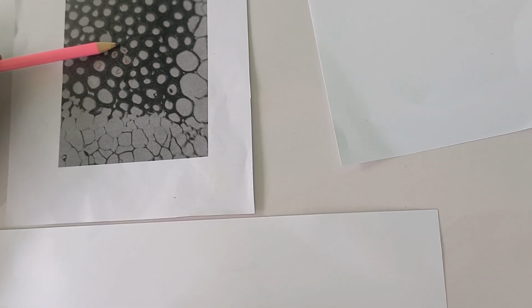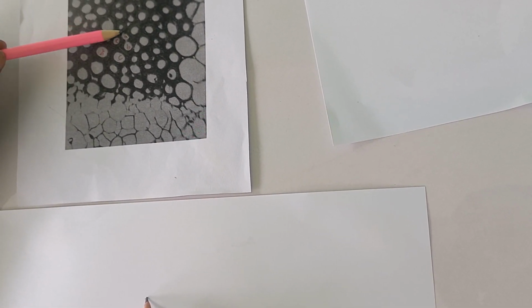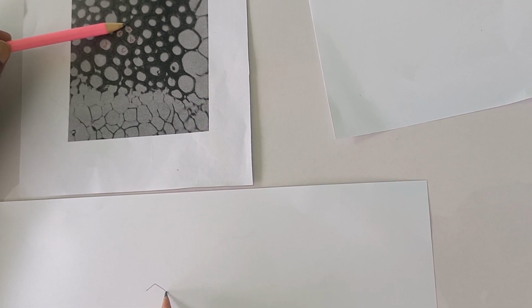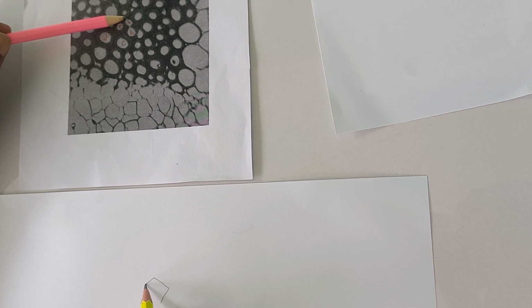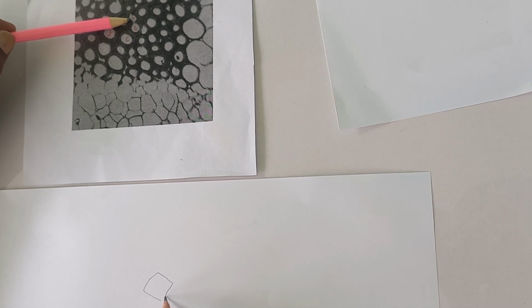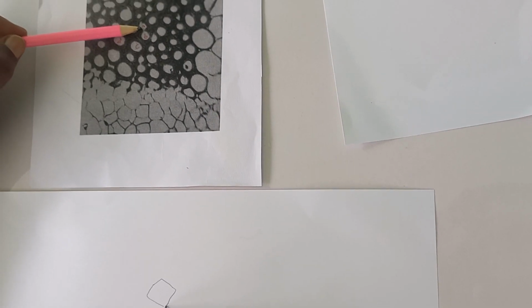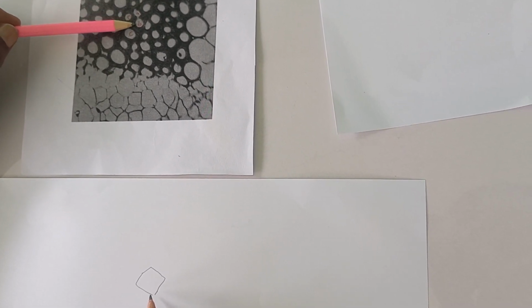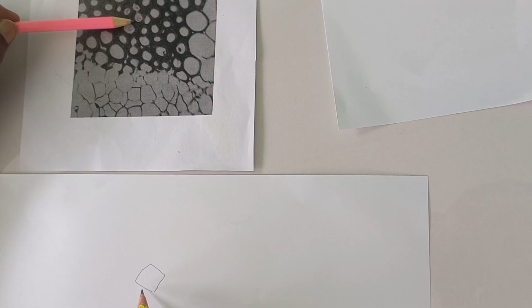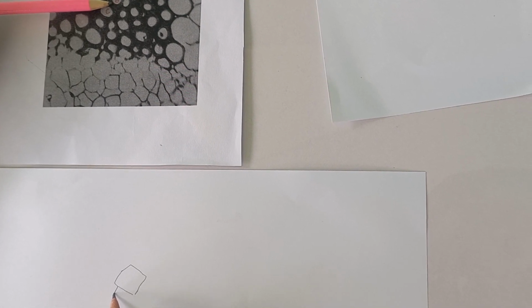So we are going to draw these few cells in. The outlines of the cells or fibers first. We are aiming at this lumen. And the cell is polygonal. So we have a cell. There's a pit here. So we leave the gap for the pit. And there's this cell too. That's a cell around it. It's polygonal. Cells are polygonal. So we put in a cell here.